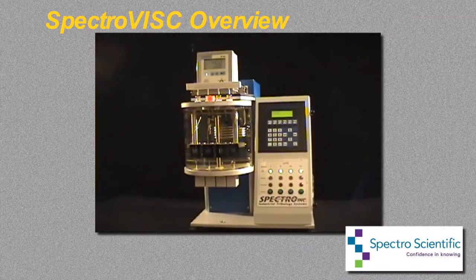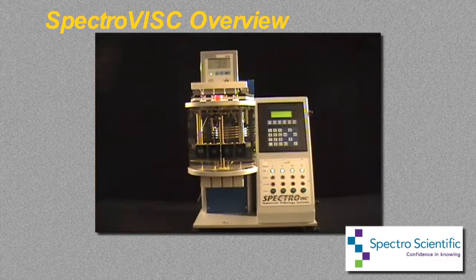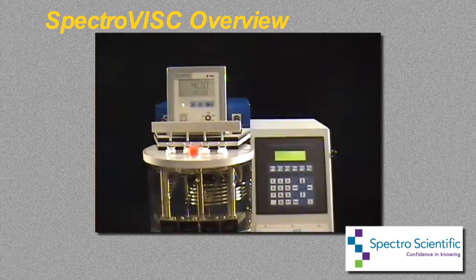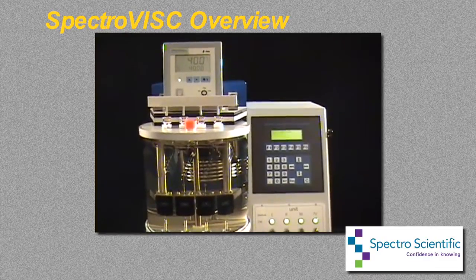The SpectroVisc is a benchtop temperature bath viscometer optimized for the analysis of used and new lubricants. The instrument conforms to all related specifications for kinematic viscosity testing, including the ASTM D445.